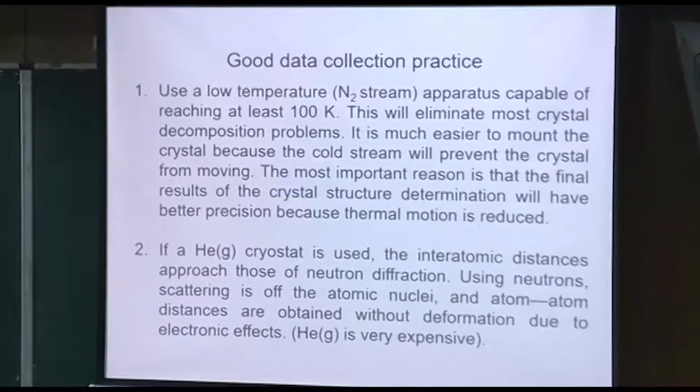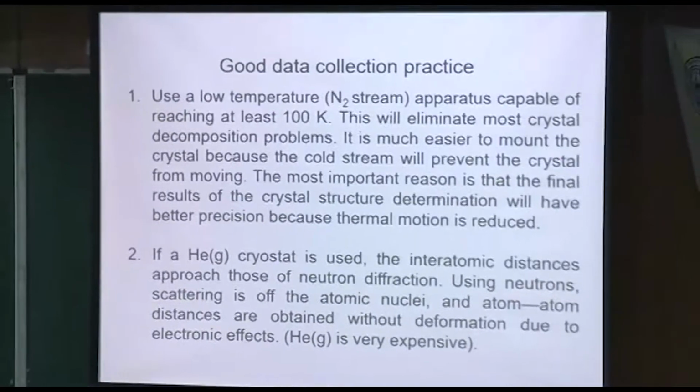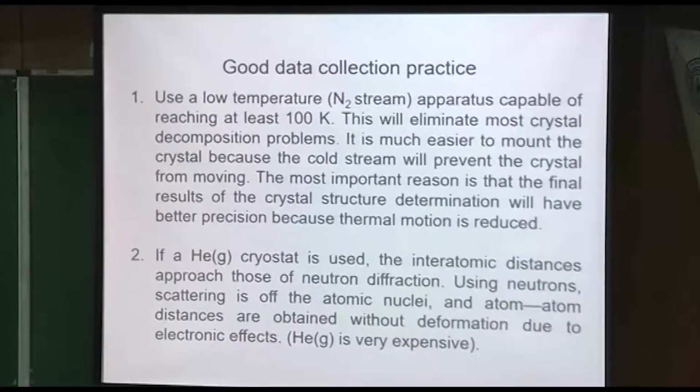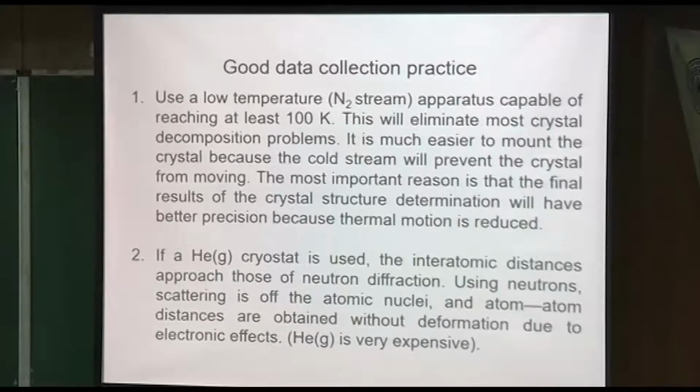Okay, so some good data practice. Again, I keep emphasizing this. If at all possible, do use a low temperature data collection. I have probably only observed decomposition in the X-ray beam once or twice in my career of collecting thousands of crystal structures, because I always have used low temperature.